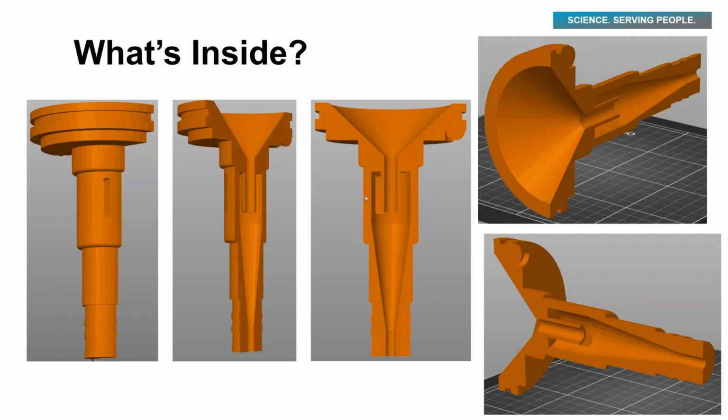Those larger particles, as they come in, because of their inertia, are hitting the side of the cyclone and spinning down, and then they're dropping out the bottom where the grit pot would be. In this particular model, I don't have a grit pot, but you can imagine that on the very bottom of this, the grit pot is there and it's covering the bottom inlet.